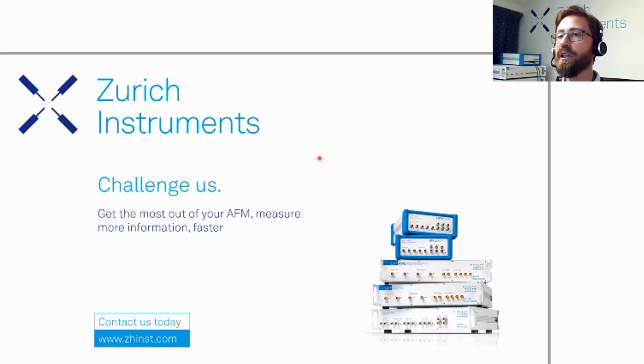We demonstrated with a Nanosurf SPM, but if you have the vertical deflection and the bias voltage, that's the very basic minimum, then you can do Kelvin probe on any third-party microscope. And for Bruker, I believe you need some signal access module to get this. And if you also get a shaker and an end of line, then it's even better.